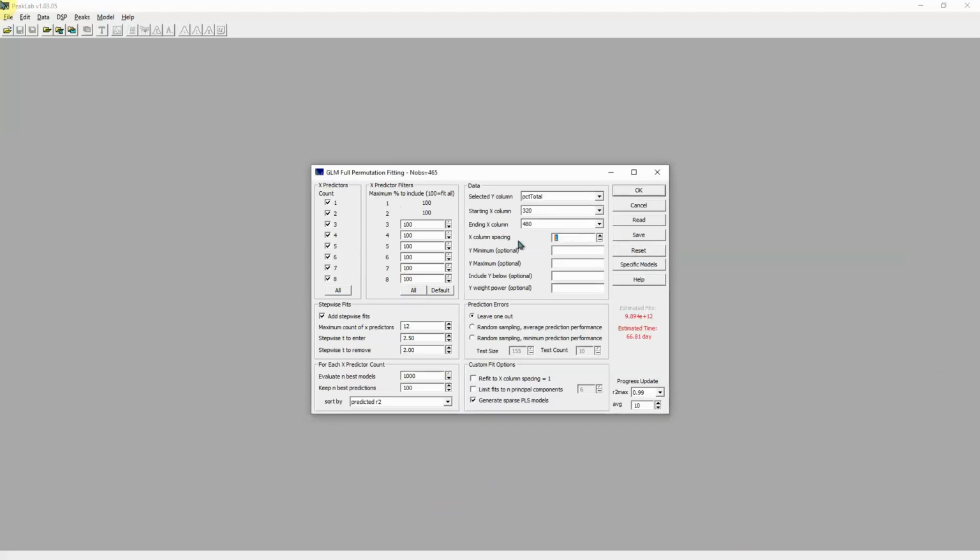In general, you will not need to change the defaults. They were designed to get you a very good predictive model. If you use this modeling extensively, you will probably become familiar with the random sampling errors to test for not fully bracketing the modeling problem, the prediction sorting, where you can use more robust metrics, and some of the other options. I will point out 2 of these.